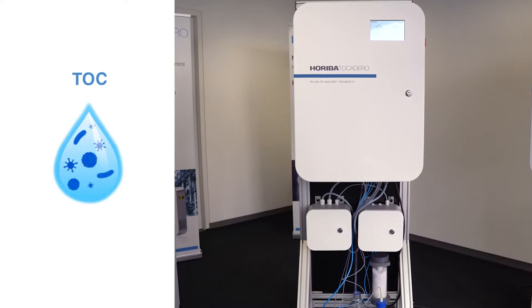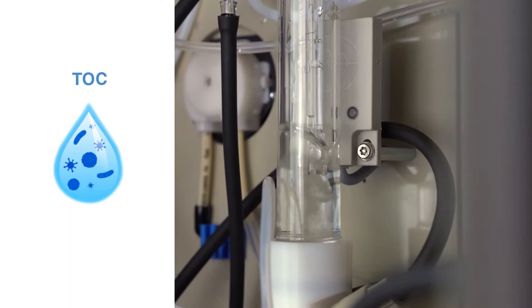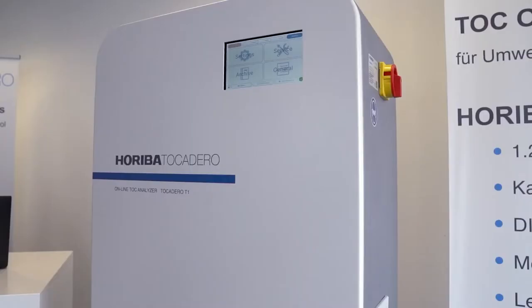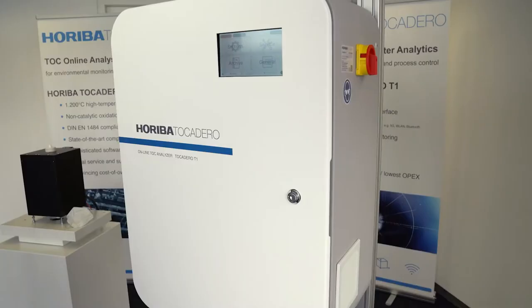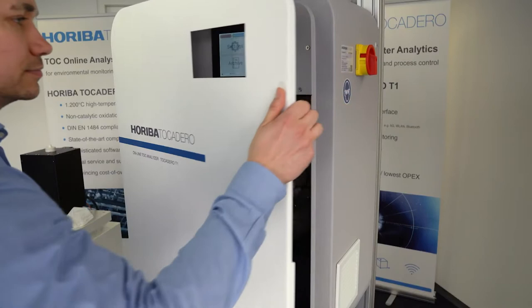One of the most important parameters of modern water analysis is TOC – Total Organic Carbon – a reliable indicator of the organic contamination and quality of a water sample. The T1 offers a flexible and powerful platform that meets even the most challenging measurement requirements.